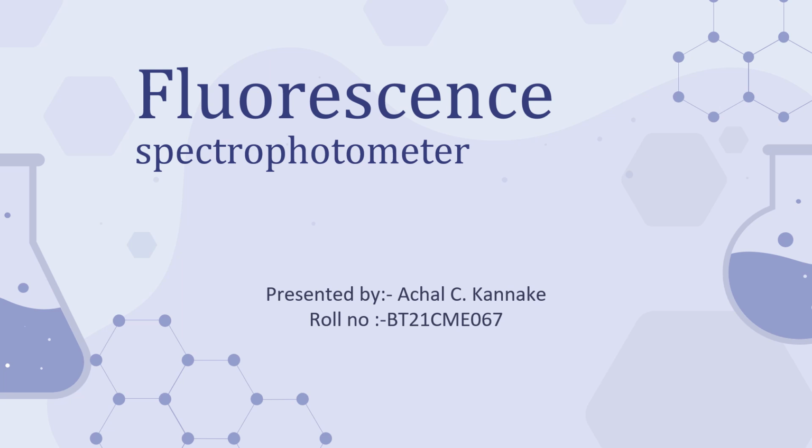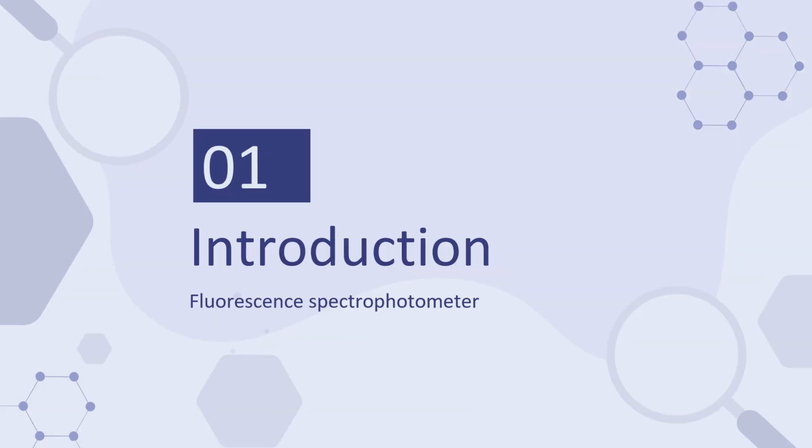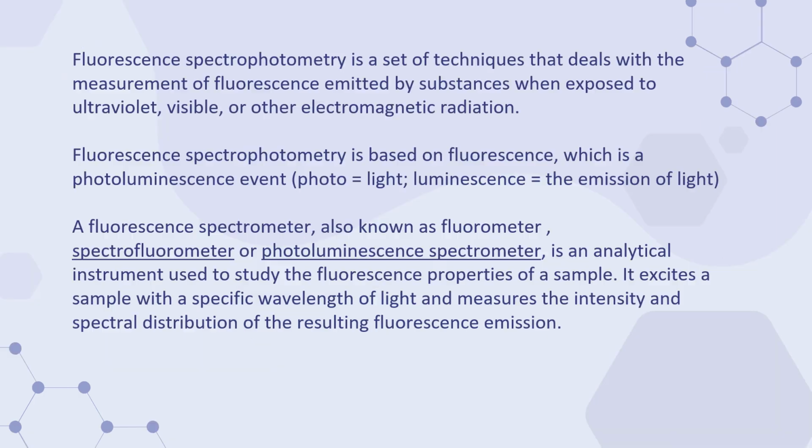My topic is Fluorescence Spectrophotometer. The table of contents I will cover is introduction, schematic diagram, concepts, light sources used, principle and application of fluorescence spectrophotometer. So here is the introduction of fluorescence spectrophotometer.